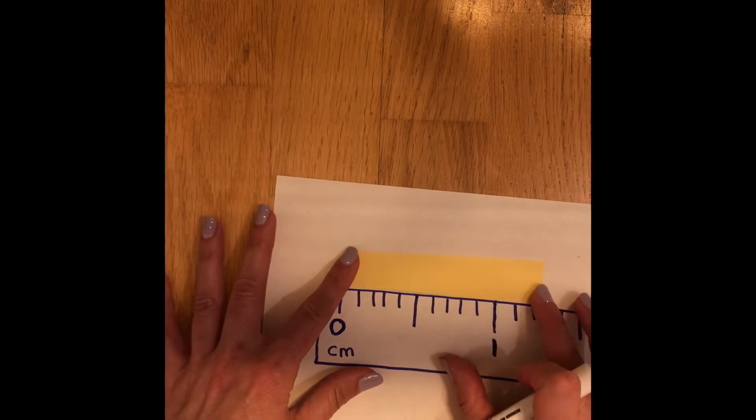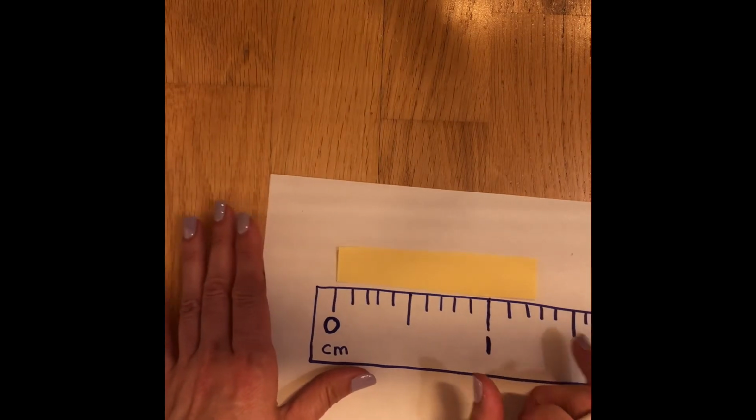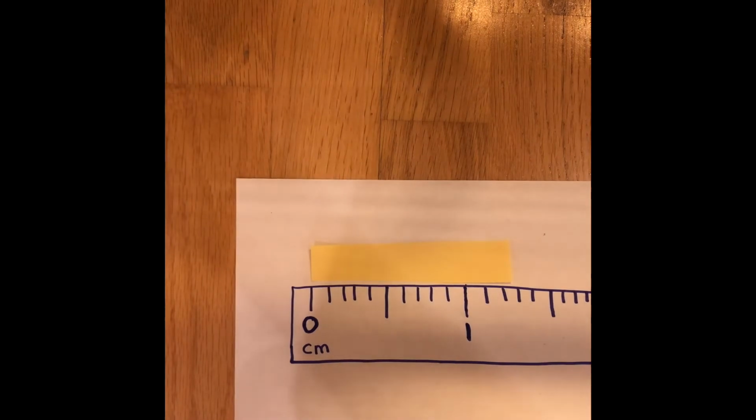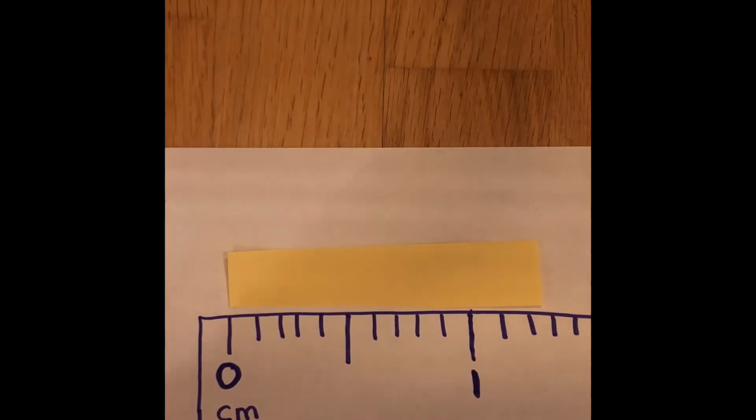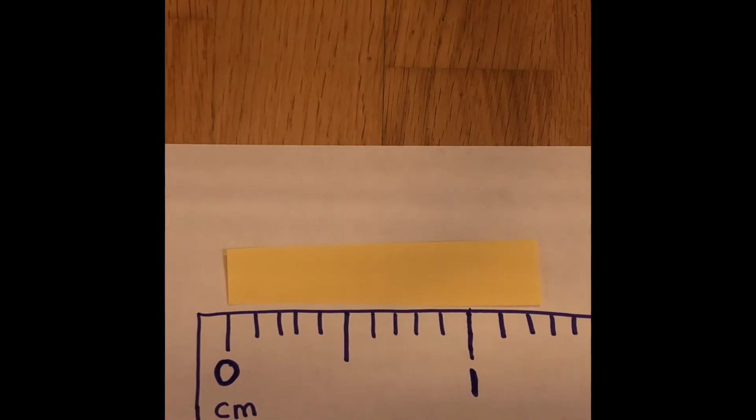I'm going to line this up on the 0, get that there, and then let's zoom in so you can see. Okay. So in this example right here, I for sure know that this reading is 1 and it's beyond 1. And so I got 1.1, 1.2. So I'm certain about 1.2. But remember, if this goes up 1/10, I get one place beyond. So maybe this is 1.22 or 1.23, or again, maybe 1.21 even.